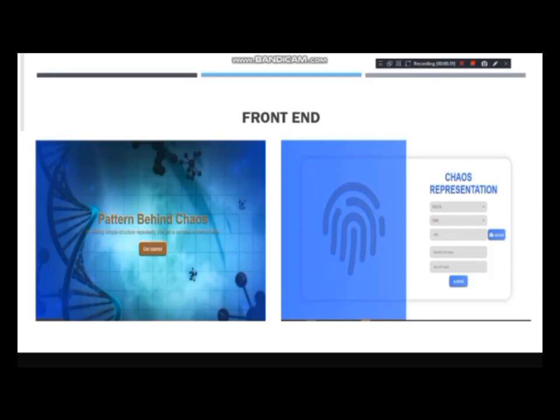The number of kmers and size of kmers. You could think of number of kmers like how many times should I run this code for the same data. Like if I enter 2, I expect to have 2 outputs, okay, and so on. Size of kmers, you are just providing the value for k.